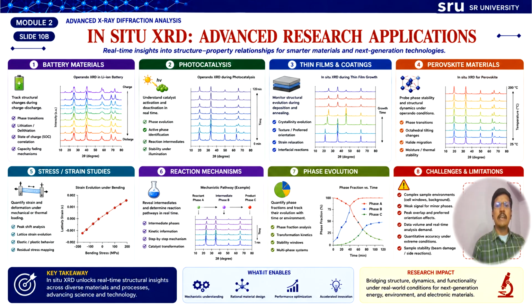In situ XRD helps to monitor the structural stability and phase changes during photocatalytic reactions. This enables researchers to identify active phases and understand the degradation mechanisms.